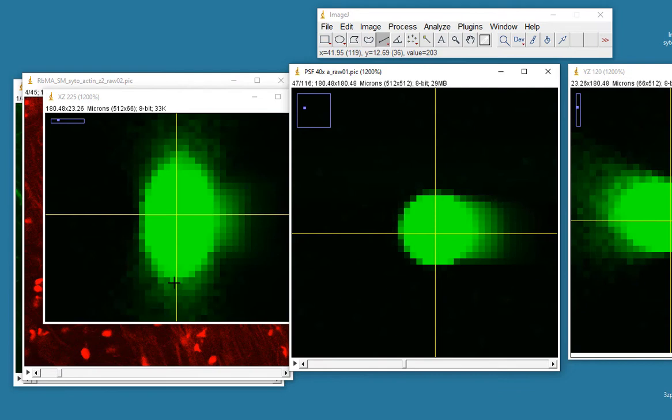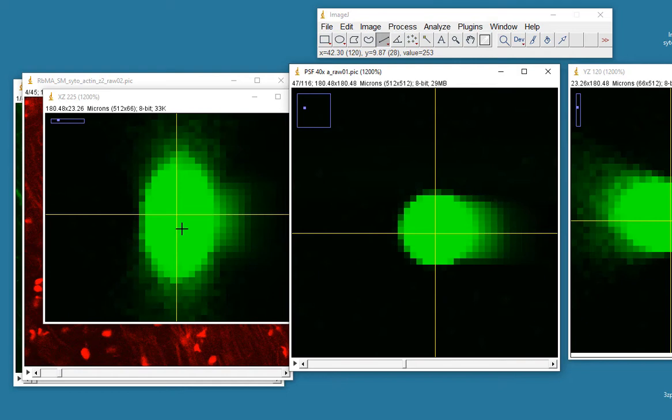So if I measure the two proportions here, and here, the two dimensions, you'll see that it's much longer than it is wide. And that's the spherical aberration, and that's what needs to be corrected in datasets which have fine detail that we're interested in, and particularly where there are fibrous structures that we might want to have a clearer picture of, particularly making the 3D reconstruction.